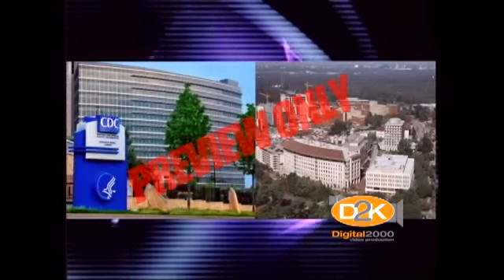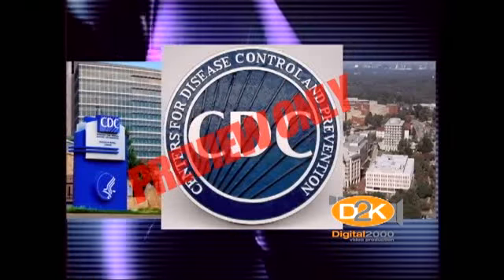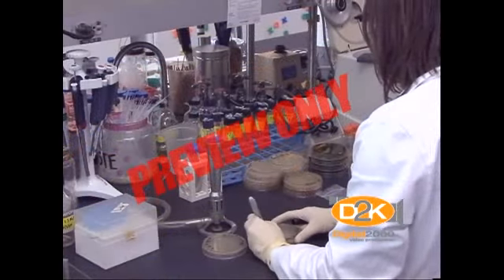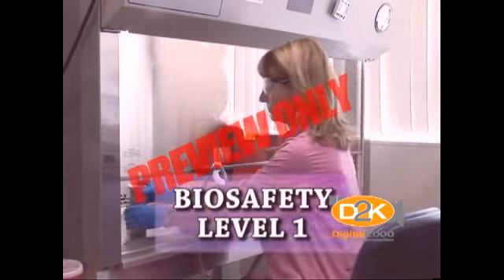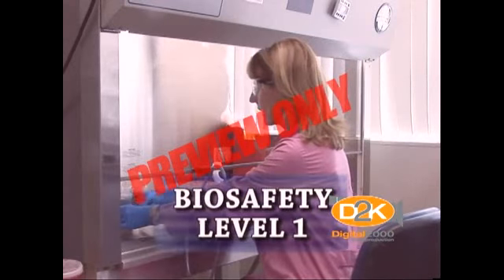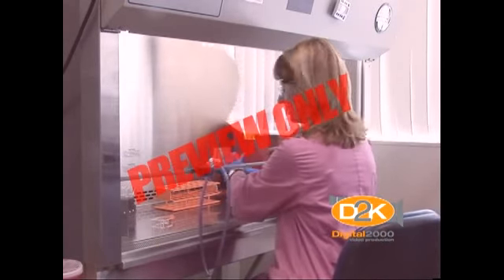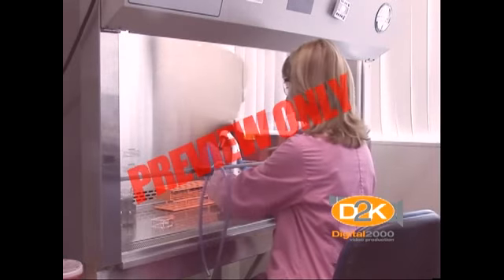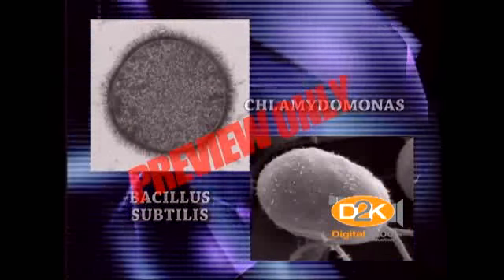The Centers for Disease Control and the National Institutes of Health have established 4 biosafety levels consisting of recommended laboratory practices, safety equipment, and facilities for various types of infectious agents. Biosafety Level 1 precautions are appropriate for facilities that work with defined and characterized strains of viable organisms that do not cause disease in healthy adult humans, for example, Bacillus subtilis and Chlamydomonas.